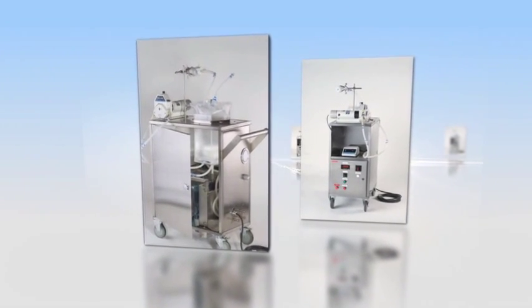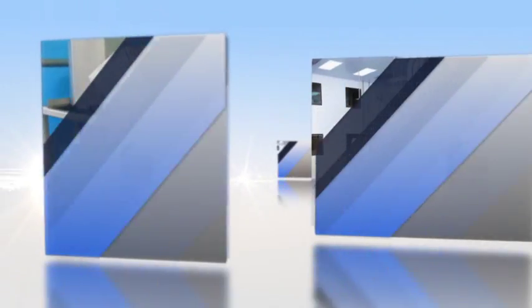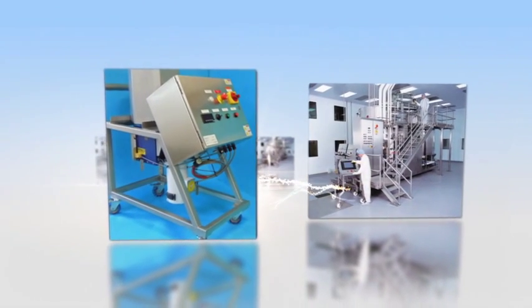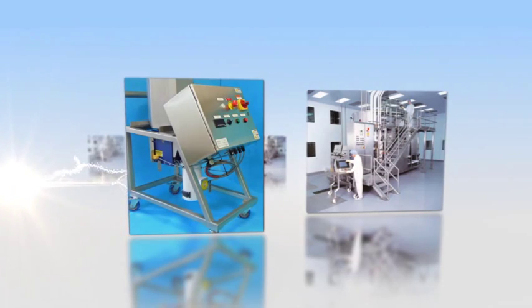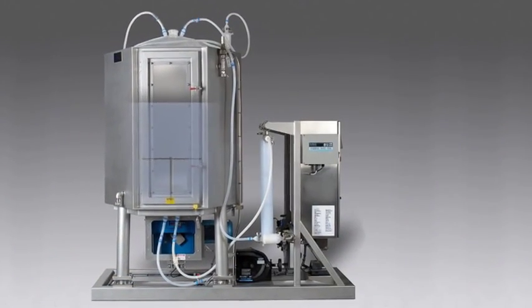Impulse single-use mixing systems can mix down to 30% of the maximum volume at full speed and maintain a consistent solution or suspension quality down to empty using speed changes and recirculation.